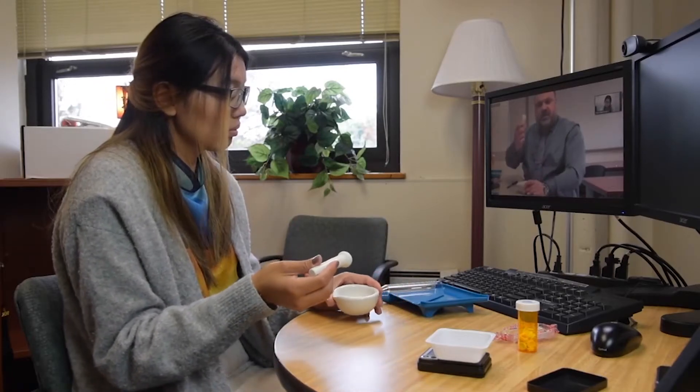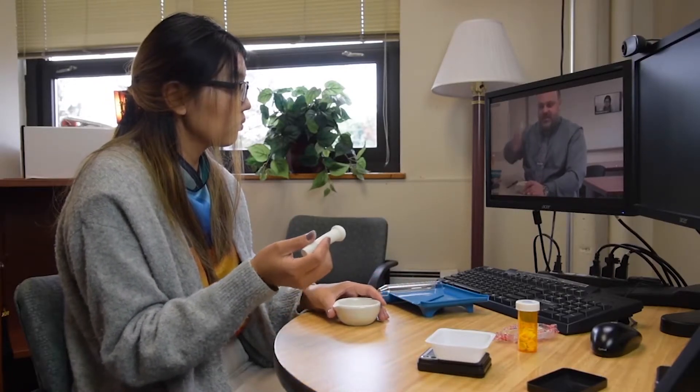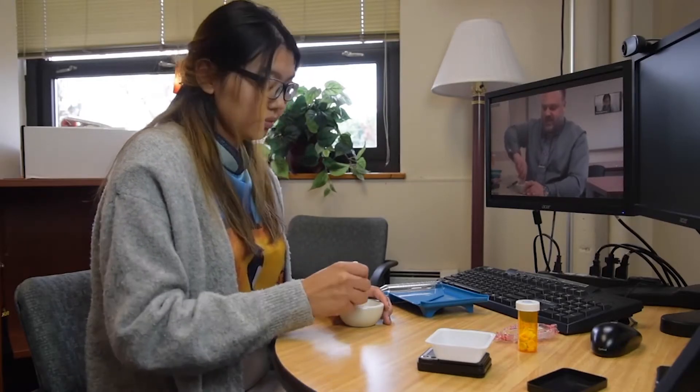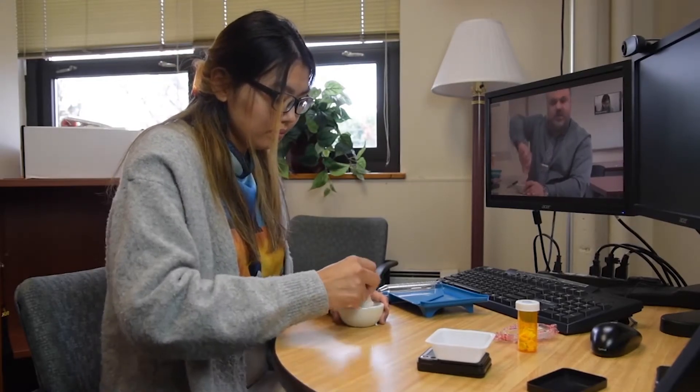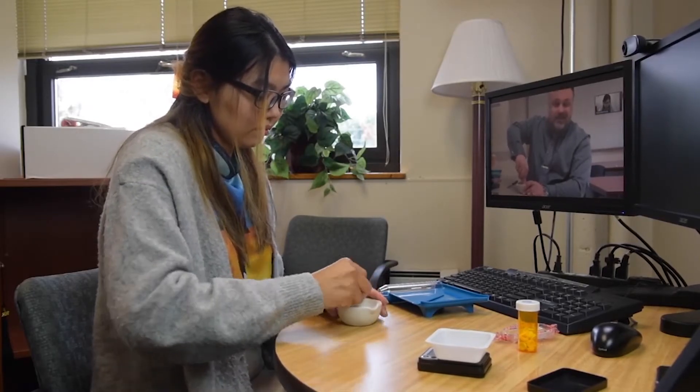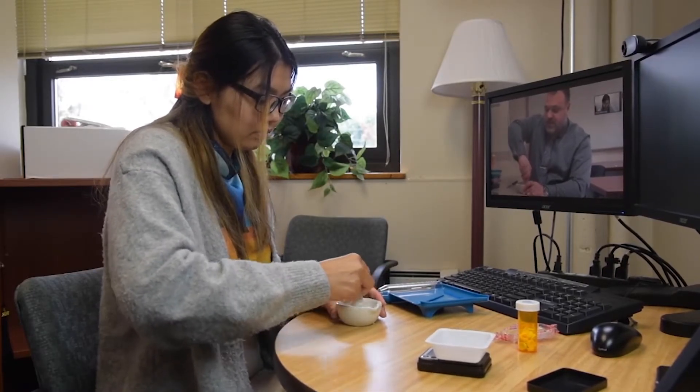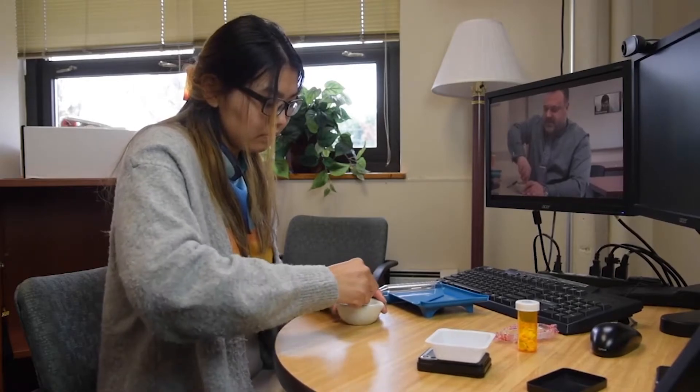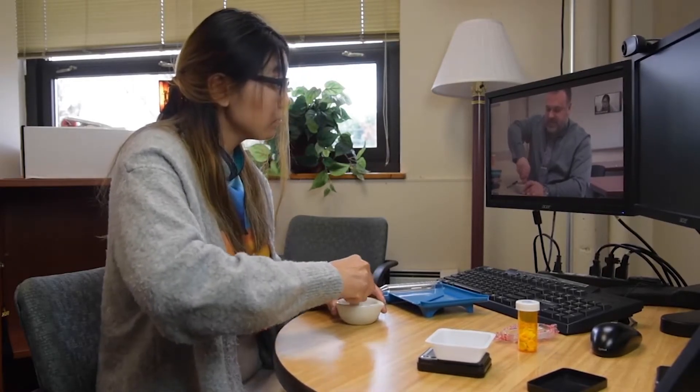Placing the mortar on a solid flat surface, you're going to get the pestle in your dominant hand and you're going to crush each of the Smarties. We use a twisting motion to make it a little easier. You don't want to pound on them or the material will fly out of your mortar.